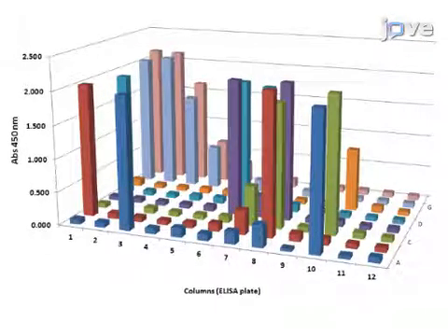The supernatant of the growing clones was tested using an ELISA to IgG. A positive clone was defined as one with an ELISA value 3 standard deviations over the blank value. At least 3 supernatants from a positive clone tested positive in the ELISA.